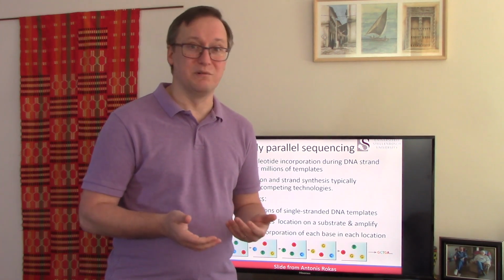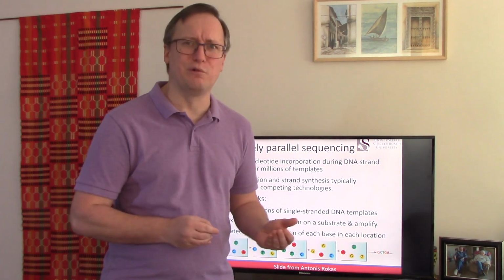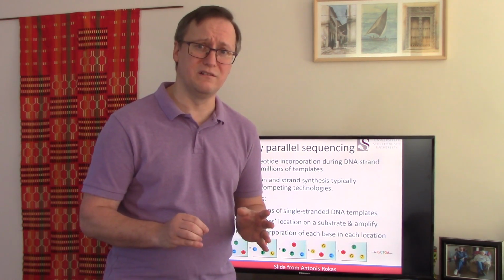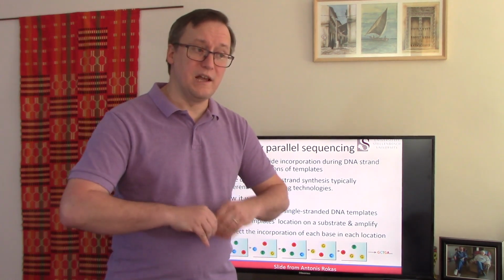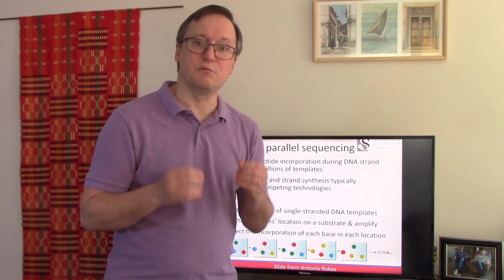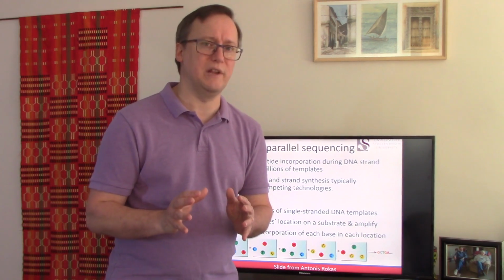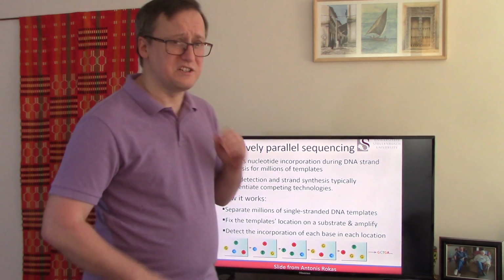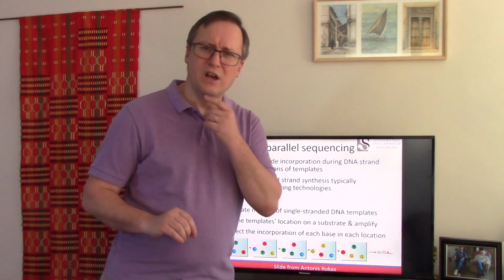However, today's sequencers do not produce 384 sequences in a single run. They produce millions in a single run. So the scale-up, this massively parallel property of these sequencers, implies that we're sequencing a far larger number of templates than was ever possible in Sanger sequencing equipment. There are some trade-offs, though. The number of sequences that we produce may be massive, but the lengths of sequences that we produce are almost always much smaller. So let's talk about why that is.